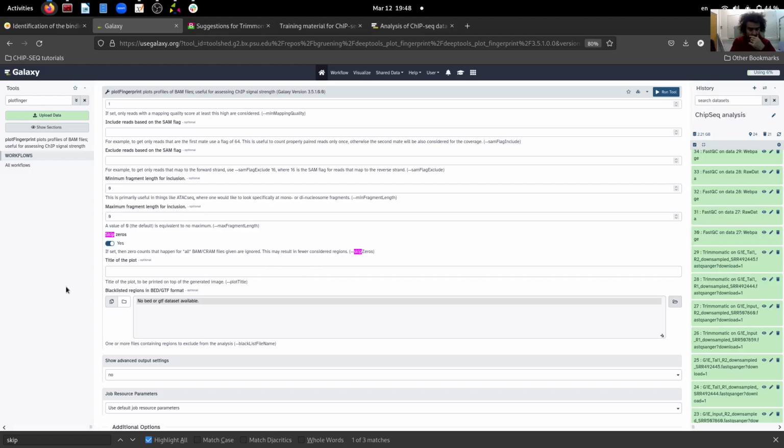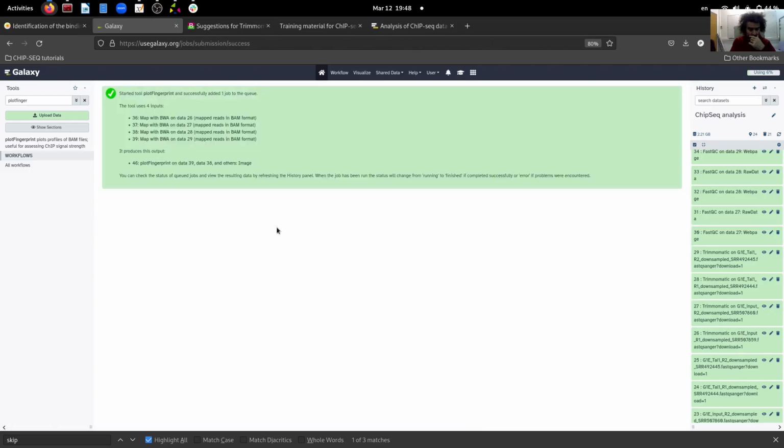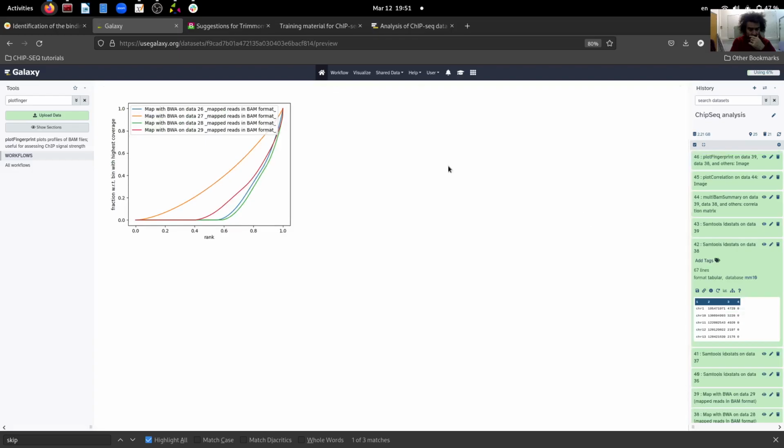Okay, and now we are ready to go. Run. And let's wait. Okay, and now we have the results. So 29 and 28, let's see which ones they are. 29 and 28. Let's see.